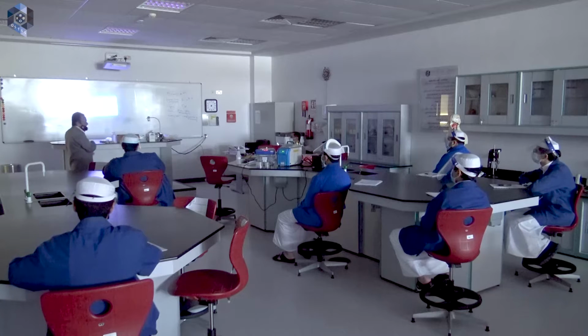So here in this lane, this band and this band would stand for what and what? For the plasmid and the kanamycin gene. While this band or this band or this band stands for what? Amadi, yes? For these two things, the plasmid and the DNA, but joined together, linked together. When they are linked together, we describe the plasmid as what? Recombinant plasmid.